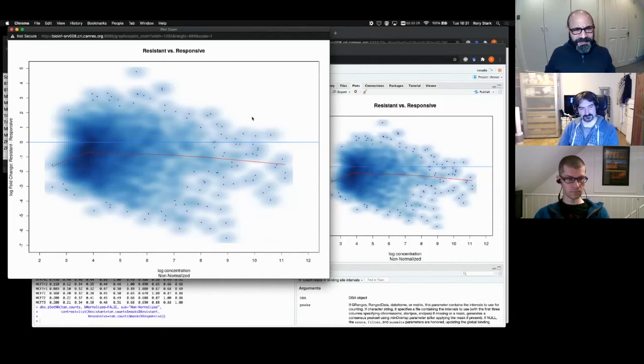The other big difference is in RNA, the range of expression values is generally higher, right? So even within one cell, you can have a transcript expressed at a very low level, or a very high level with hundreds of thousands. While if you're looking at chromatin, let's say you've got two copies of the DNA. The most data points you can get is 2, right? You can't have 100,000 transcripts coming out of one cell. That's one of the reasons why single cell is difficult in this area, and we rely on the bulk. But these really are different data, and there's a temptation to just treat it like RNA-seq data.